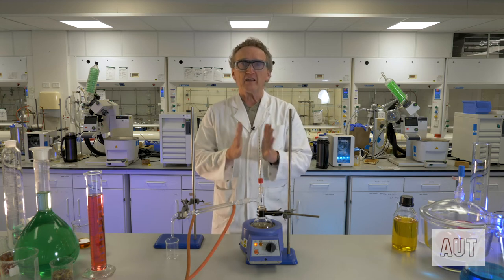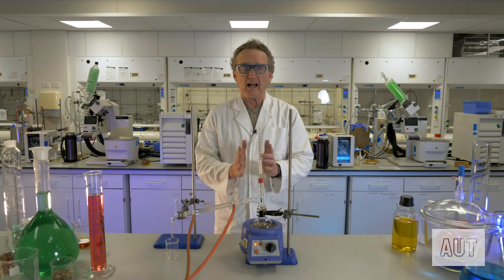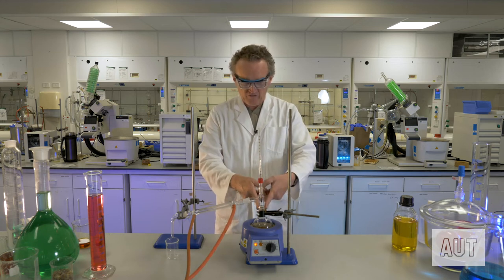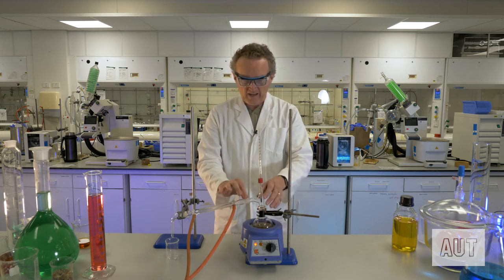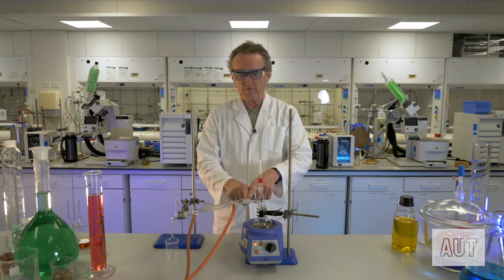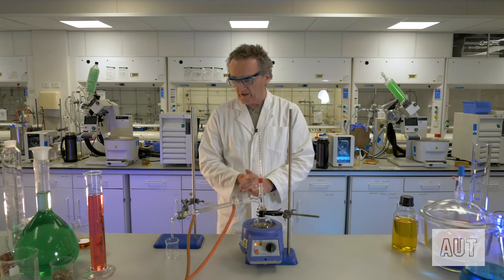So, having said that, it's really important that all of your joints are tight. Otherwise, what's going to happen? All the vapor is going to escape. So that joint needs to be tight, that joint needs to be tight, that joint needs to be tight. Make sure, particularly this one, slips off very easily if it's not clamped correctly. So everything looks to be pretty good, I'd say.